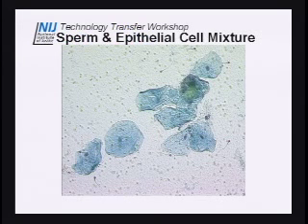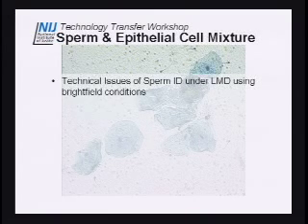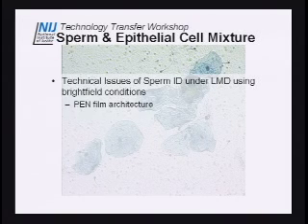Okay, so here's that epithelial sperm cell mixture again, and this is my homemade version, not the fancy Leica version. Actually, no, there are a couple of things to talk about. What are the technical issues of sperm ID using LMD under bright field conditions? I talked briefly about this right at the beginning: that pen film architecture, the pores that you will see.